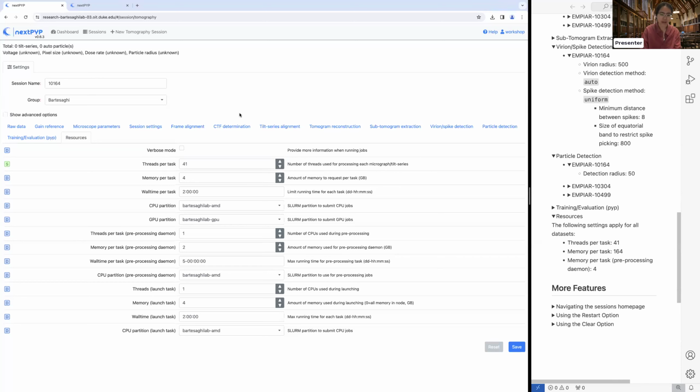So what might happen in that case is you will need to run 2 different jobs, or your data will be split across 2 jobs. So in the first run, you'll process 32 of the 41 tilts. And then in the second round, you're going to process the 9 that were left over. So if you don't have enough threads such that each thread handles 1 image in your tilt series, your processing is going to be split into 2 batches. It will be slightly slower in that case because you can't take advantage of the full resource maximization.